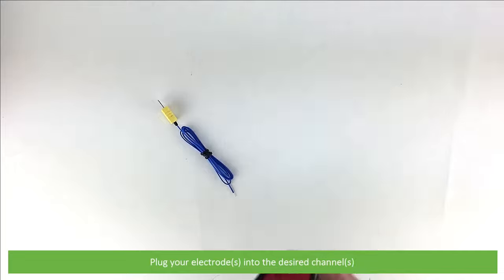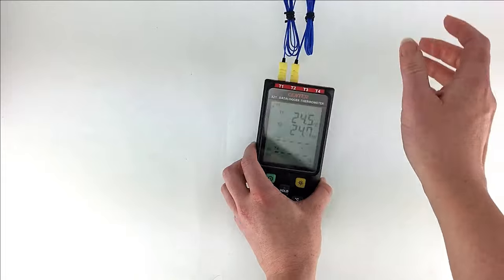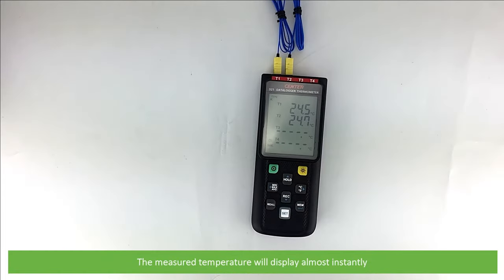Plug your electrodes into the desired channels. The measured temperature will display almost instantly.